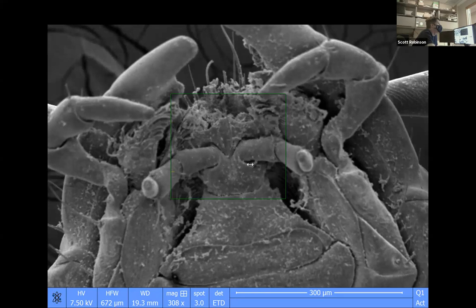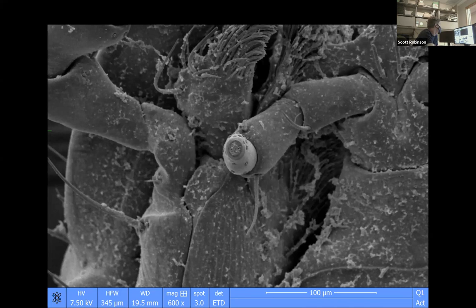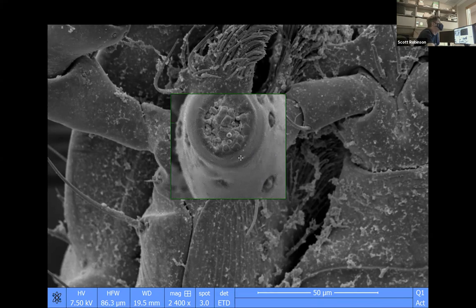So the reason that we can see these things is because of the diameter of the electron beam itself. The electron beam may be a nanometer in diameter in some cases, and that gives us a better image, a better ability to see things that are that small.